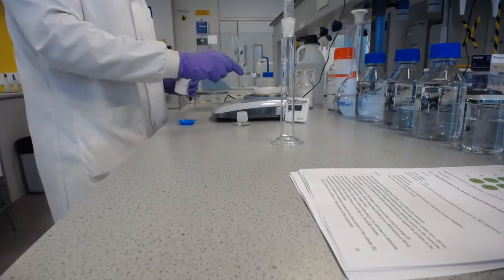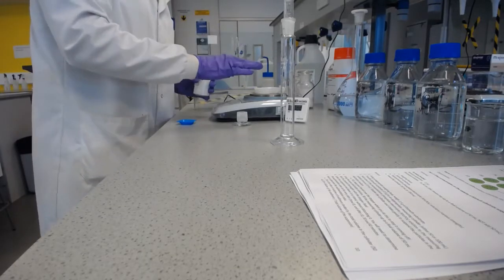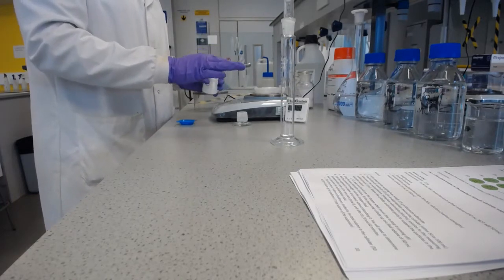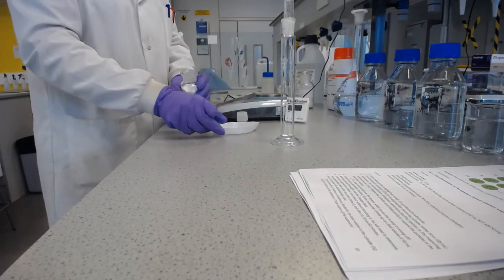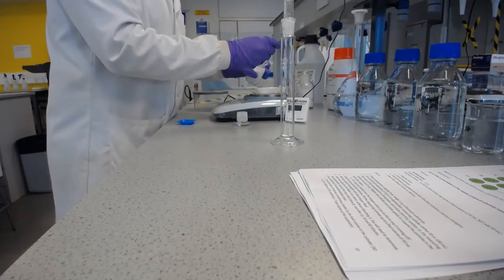Now this is a very large weighing boat, and it's actually taking up pretty much the whole of the scales. So I'm actually happy in this case to put the powder directly onto it, but if I do spill any, I need to make sure I clean it up after. And if you're ever unsure, you need to make sure you take the boat off and put the powder in somewhere else, and then put it back on. Okay, so I'm going to put this straight on.